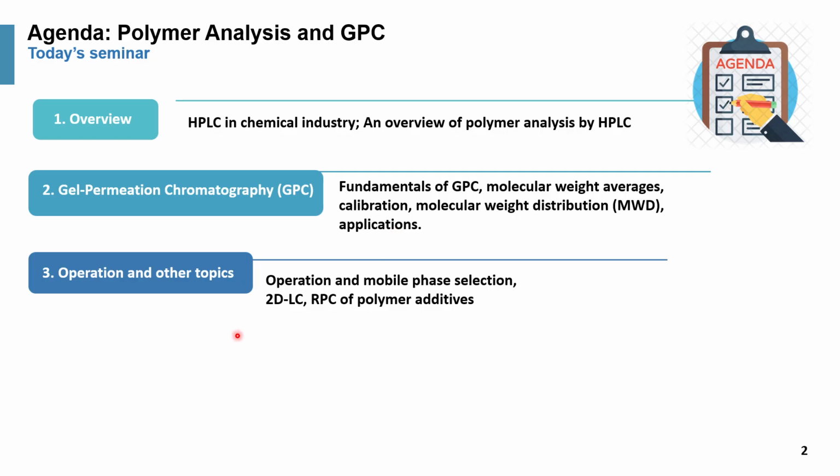Finally, a few common operation and topics such as the GPC operation, mobile phase selection, and a couple of case study on two-dimensional liquid chromatography, 2DLC, and reverse phase chromatography of polymer additives.